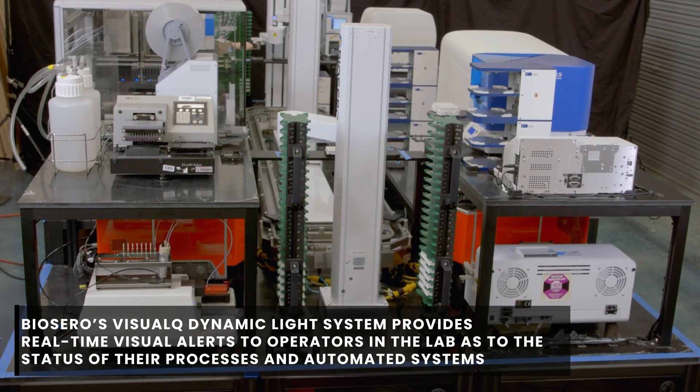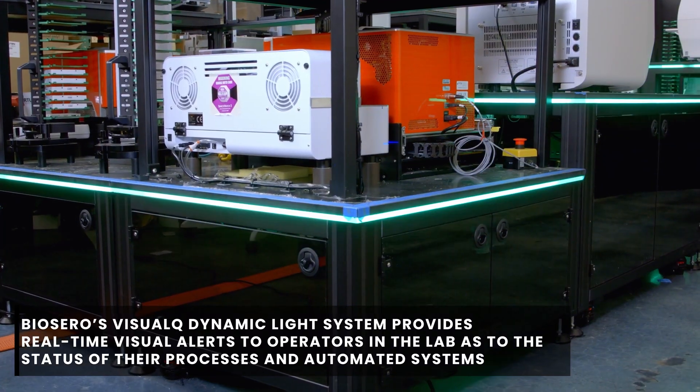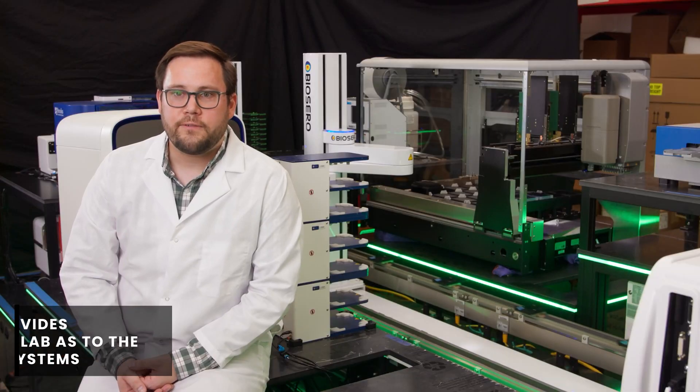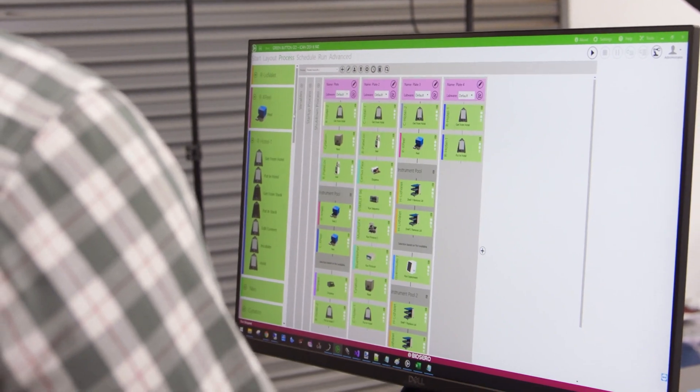We also employ the colored LED strips that you see on the side of the system to show the current system's status: in operation as indicated by the green light, or it will either change to blue or red if the system is paused or in error, respectively. This helps notify the user in the lab if attention or corrective action is required for any particular instrument on the system.